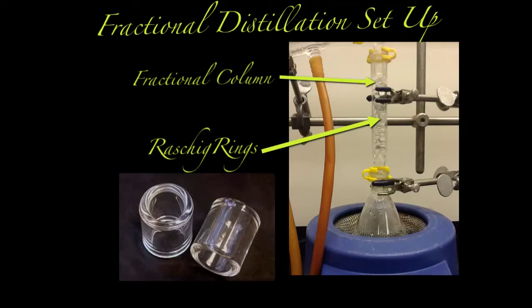We will also be performing a second type of distillation called fractional distillation. Essentially, we have the same apparatus as before with an additional fractional column shown here. The column is packed with Raschig rings, which are cylindrical rings that improve the efficiency of obtaining pure ethanol. And we will discuss how they perform that mechanism in a later slide.